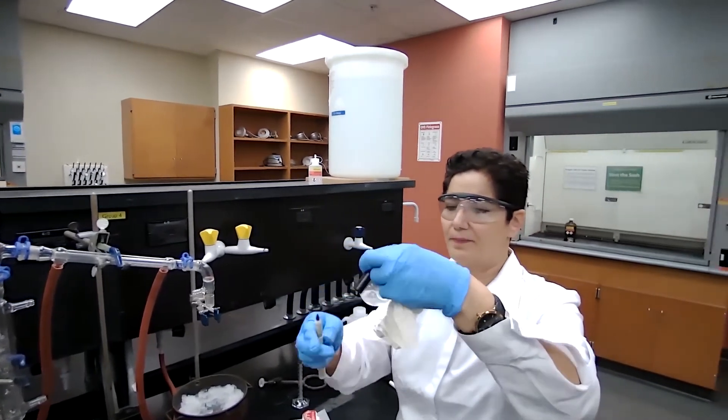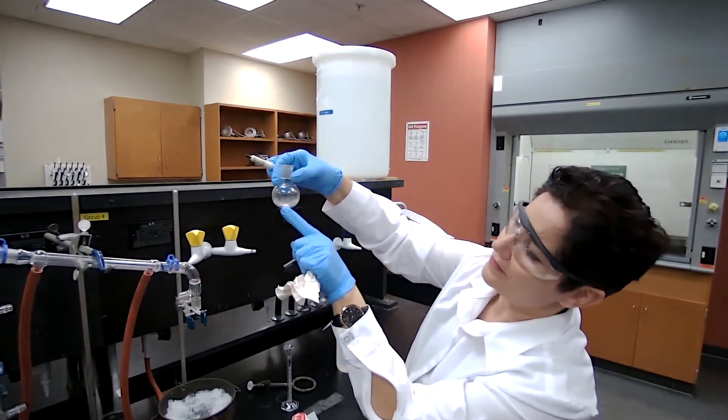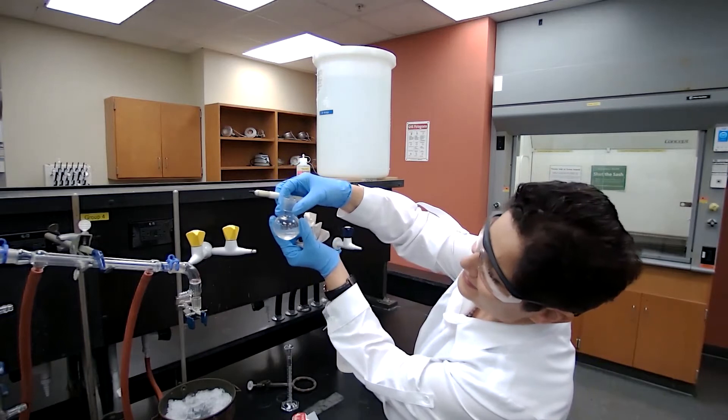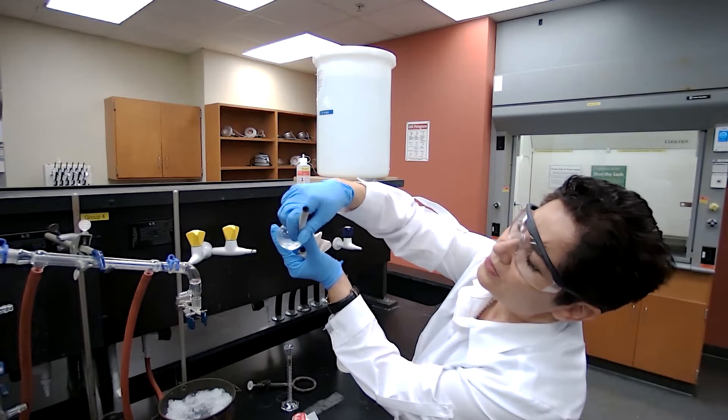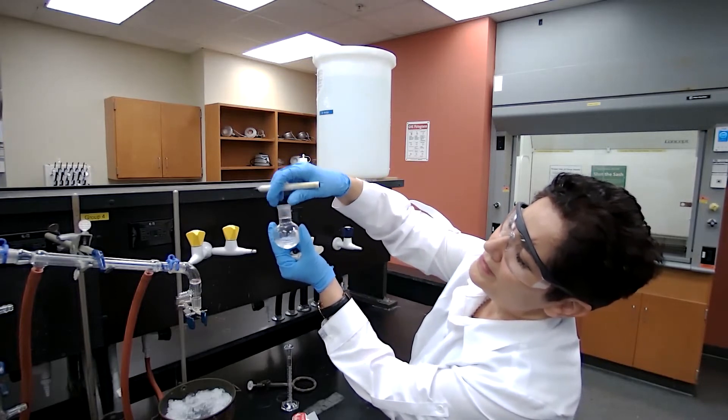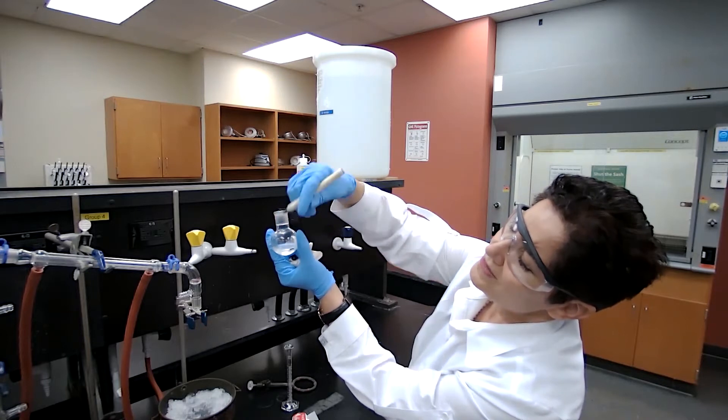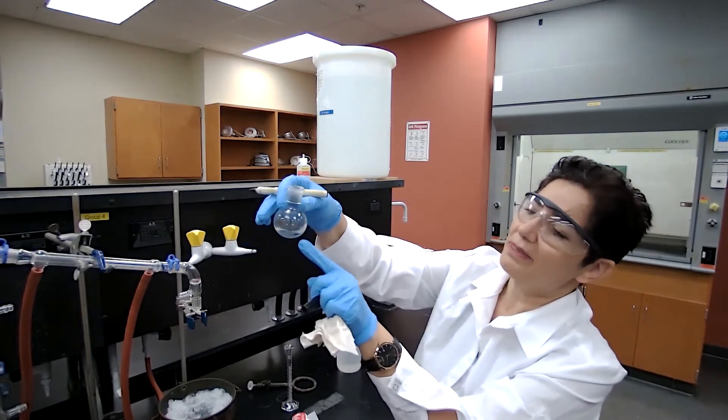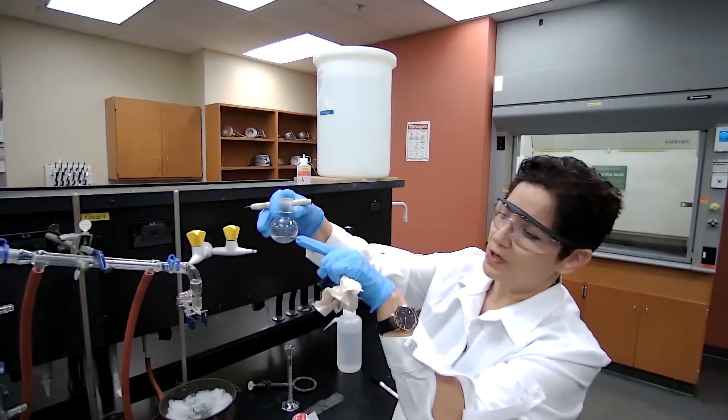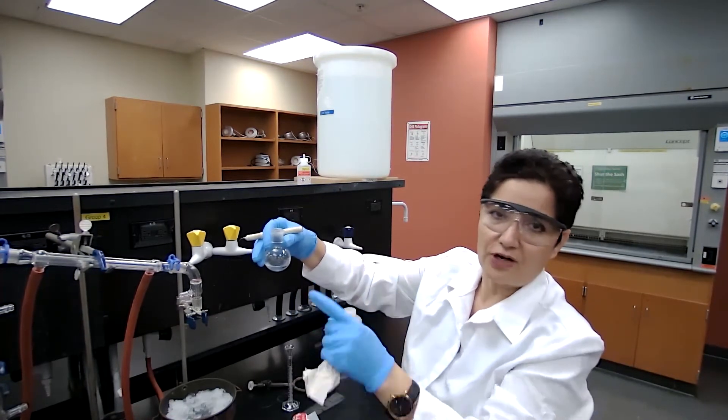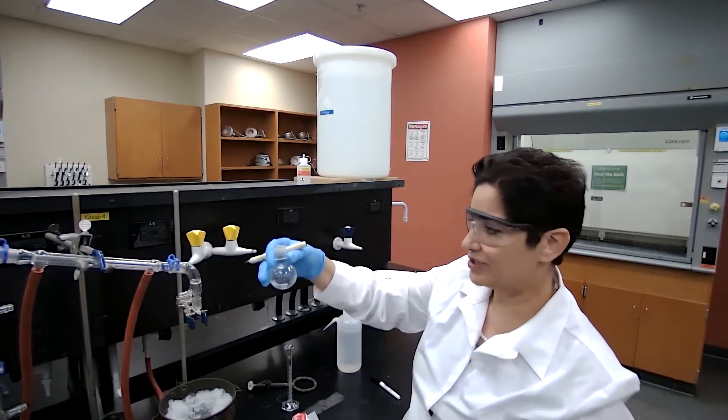Now see how high, what's the height of the liquid in the flask. We can mark the height of the liquid. When the level of the distillate reaches this mark, I know I have collected 10 milliliters and I can stop the distillation.